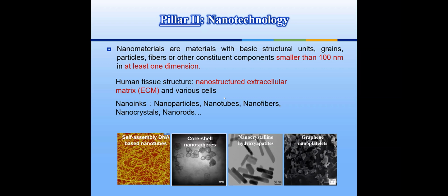The other reason is related to the limitation of many current 3D bioprinting systems. They can print pretty cool micron-sized scaffolds, but it's really hard to go down to nanometer dimensions. There are some nano printers available, but they normally fabricate pretty tiny objects. For larger tissue organs, we need larger printing, which is really hard to achieve.